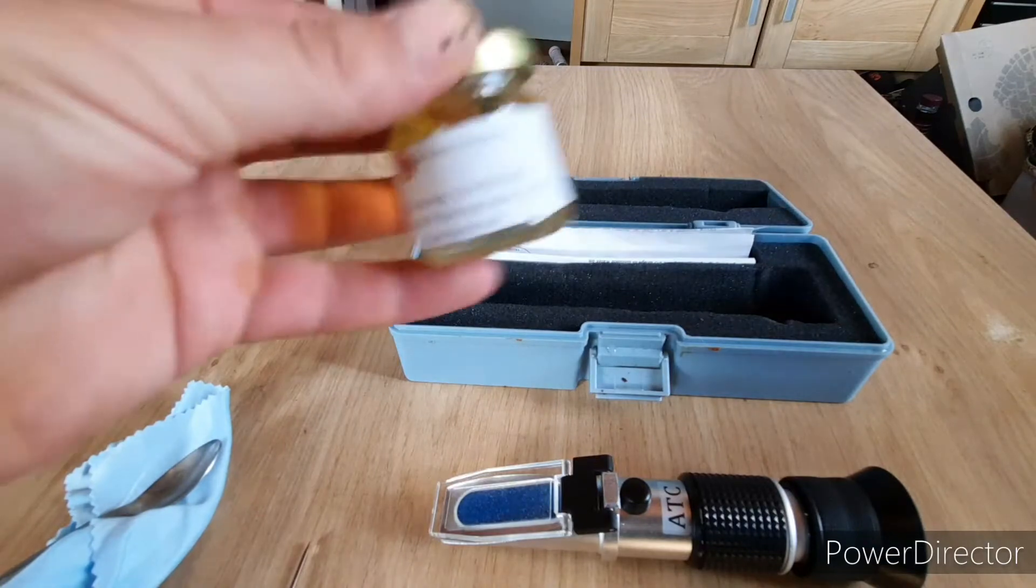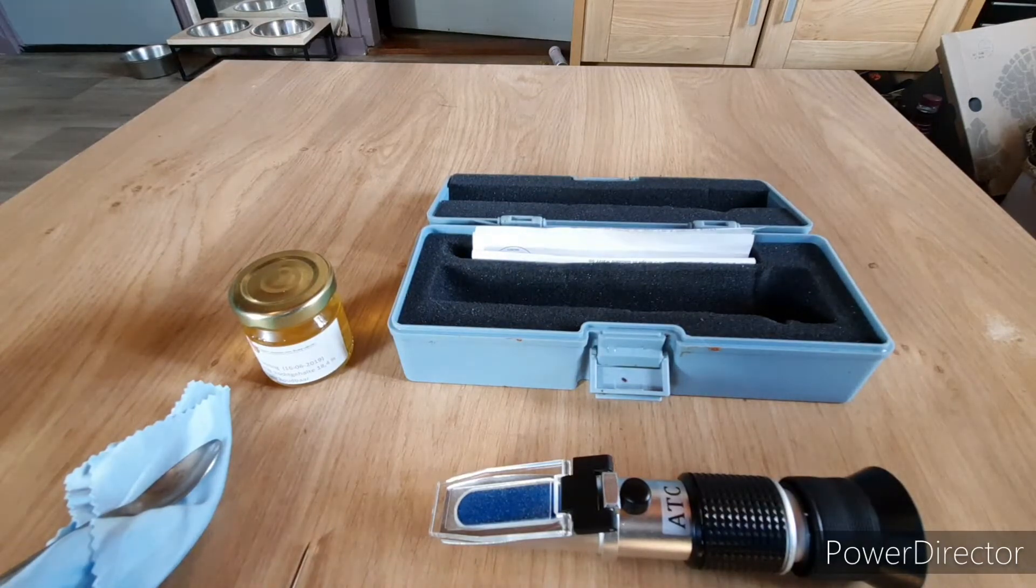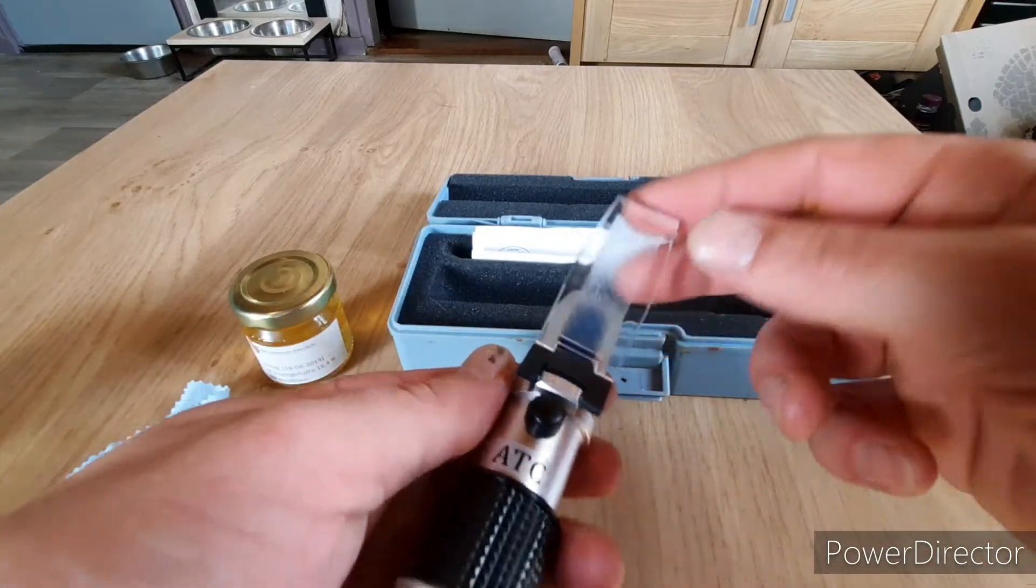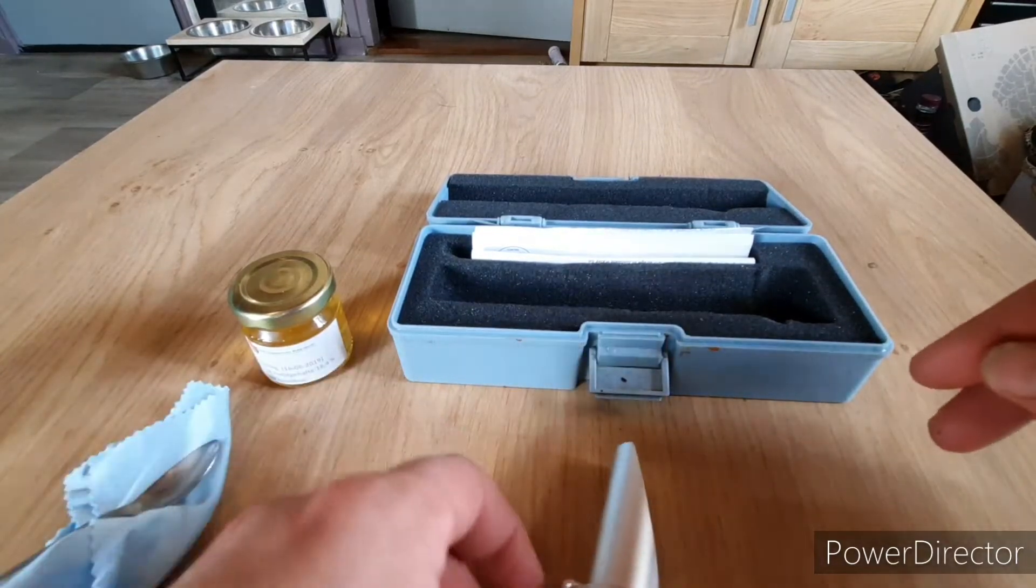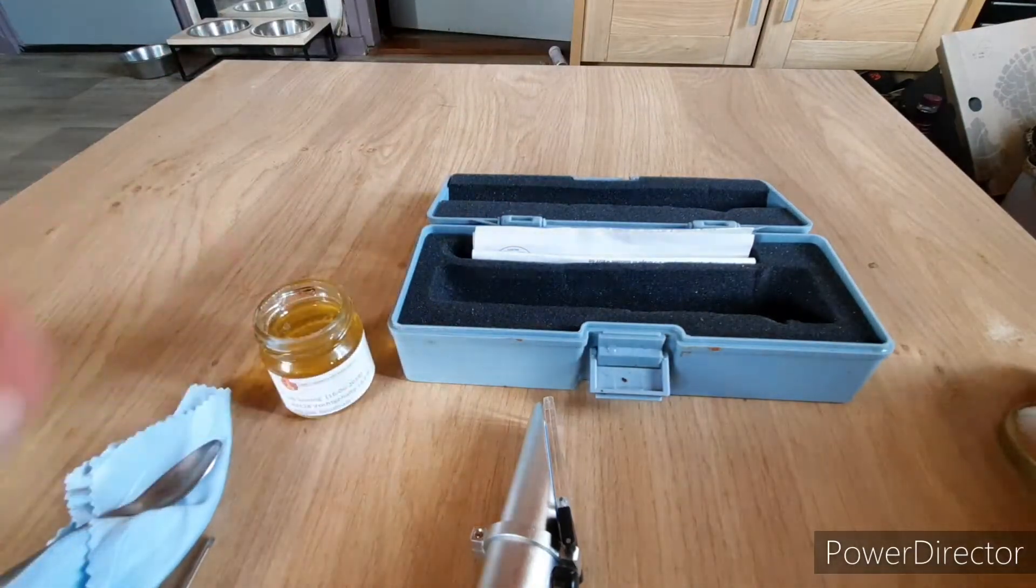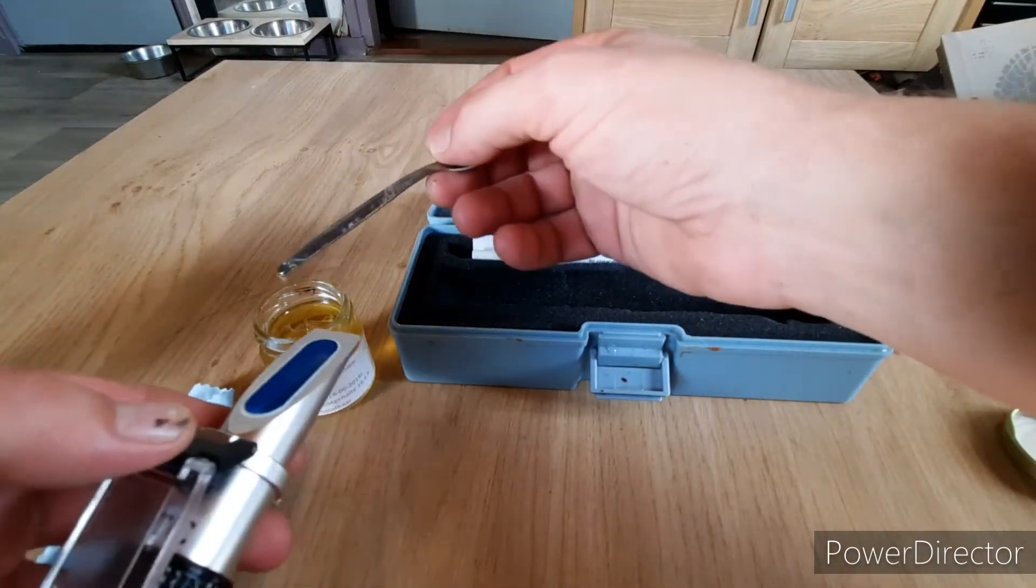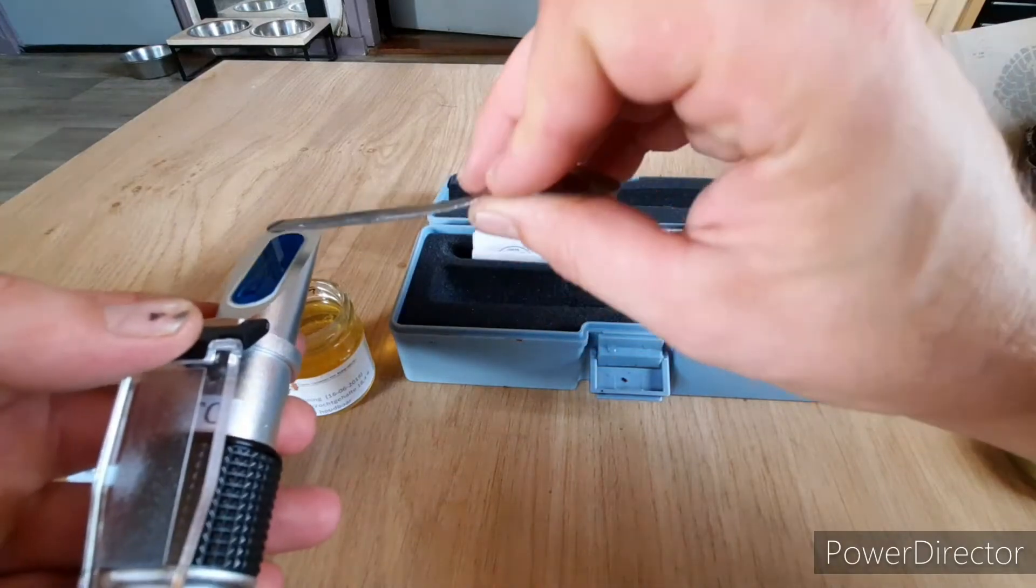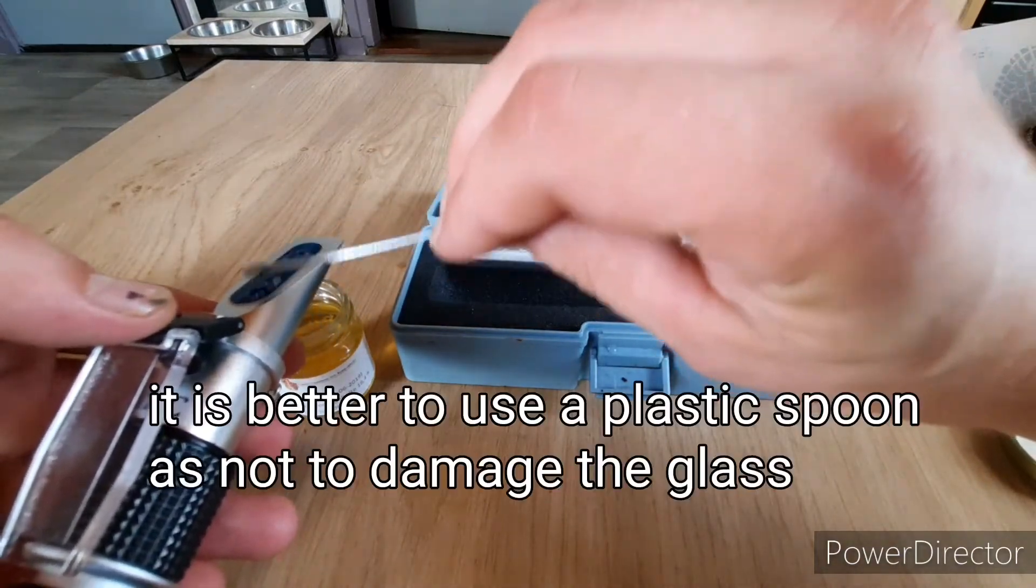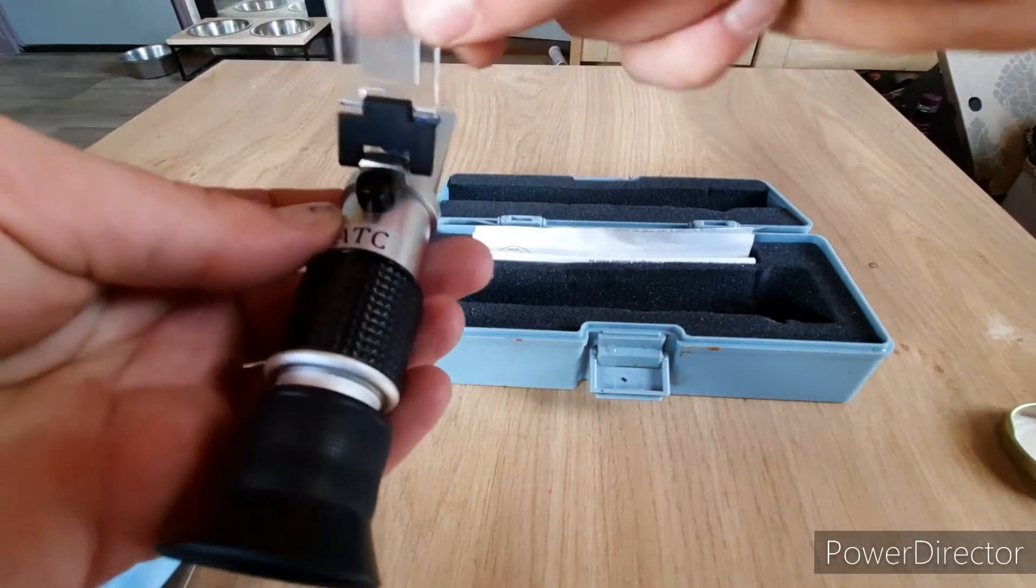The only sure way to know honey is ripe is with the refractometer. So how do we use it? Well, we'll open it up, I'll open the honey, and just take a little bit of this calibration honey, put it on there. It's glass so be careful. We close it up.